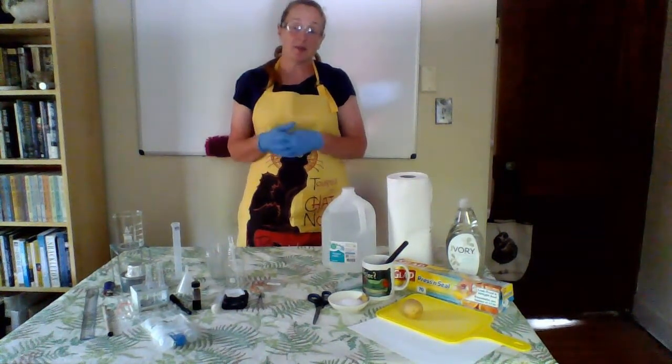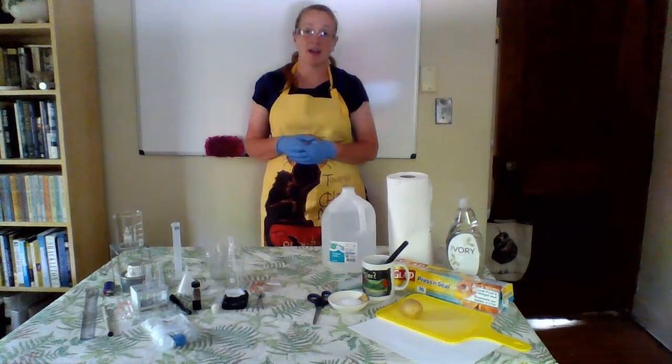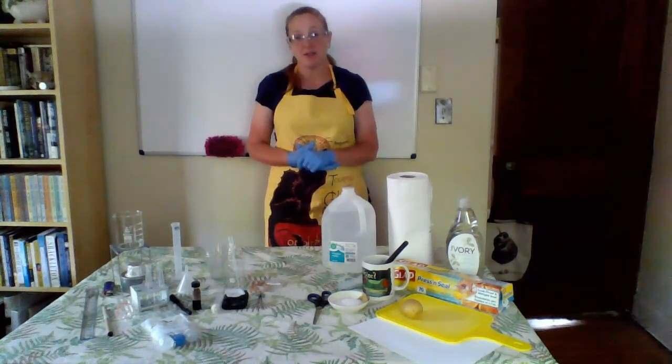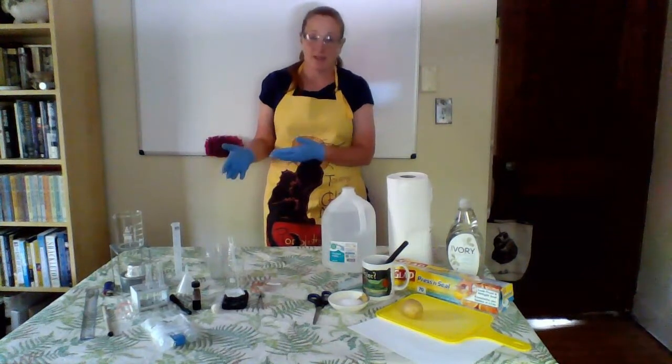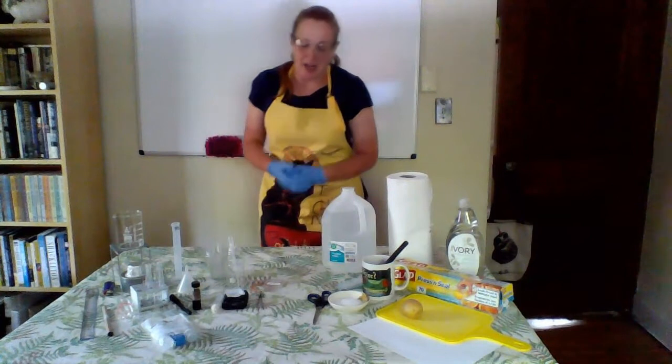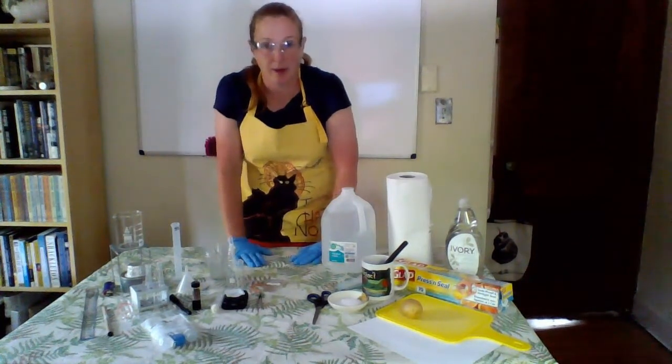So please note that with this lab, you are going to have a little bit of a duration. So keep that in mind. You're going to set things up, kind of forget about them for a little while, but don't forget too long, and then continue on with your experiment.